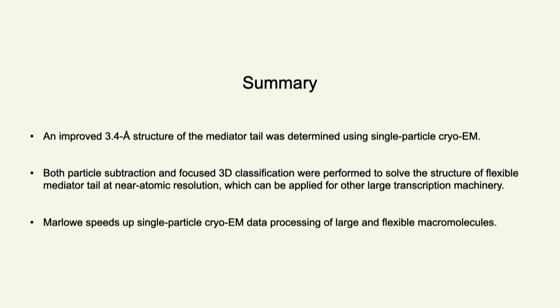So in summary, we improved the structure of the Mediator tail to 3.4 angstroms, determined by single particle cryo-EM, using particle subtraction and focused 3D classification. We can solve flexible domains to near atomic resolution. And last, Marlowe sped up data processing.